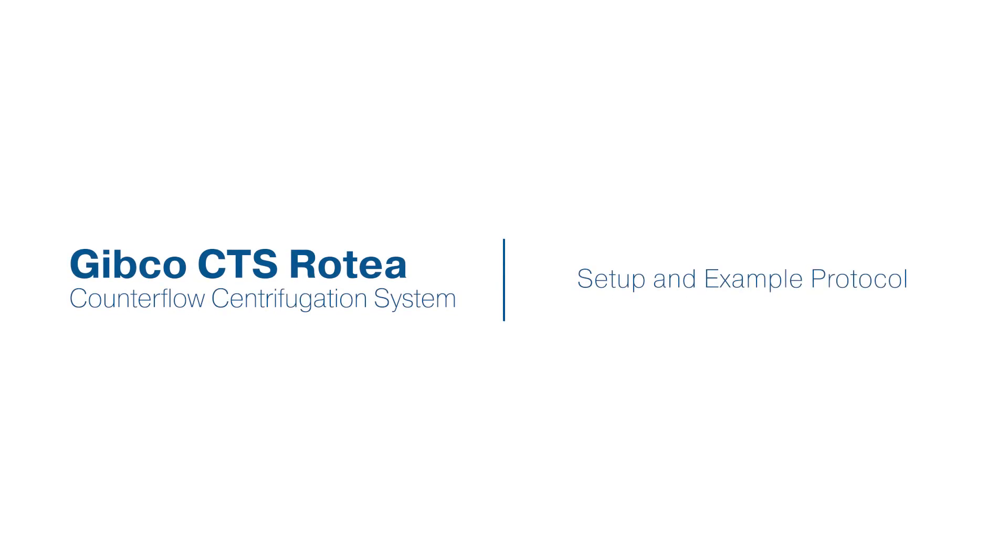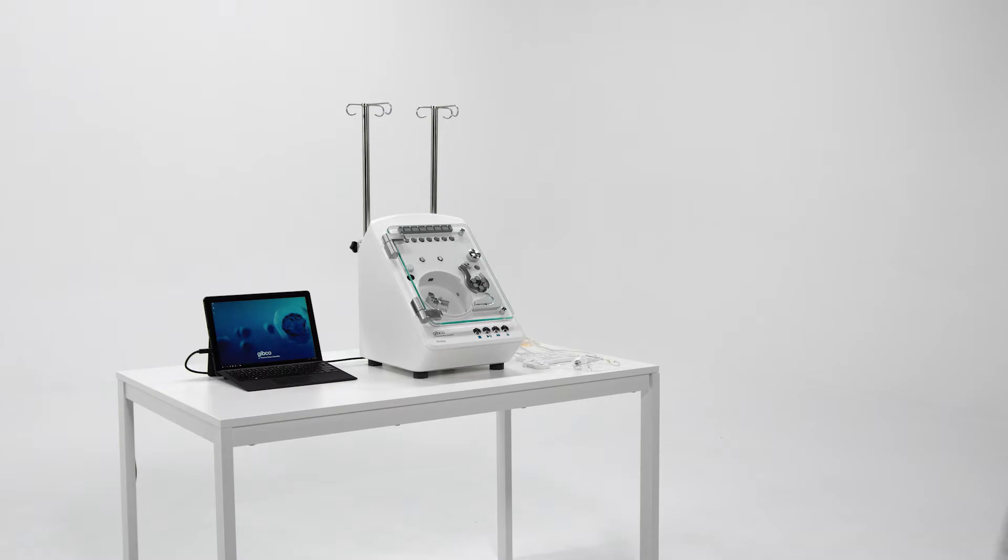In this video, we'll go over how to set up the Gibco CTS Rotea Counterflow Centrifugation System and walk through an example protocol.